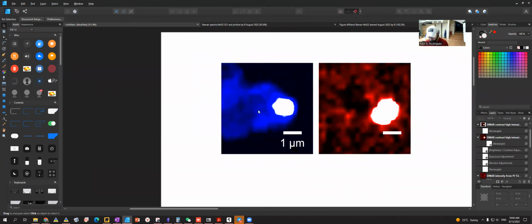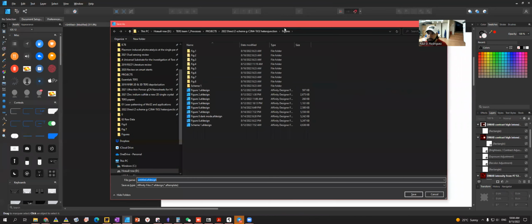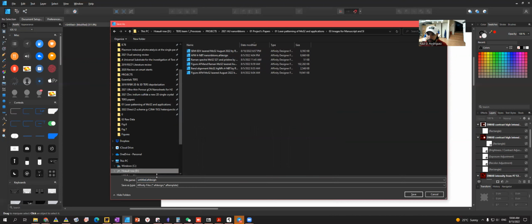Something else that is very important is to save your projects. I need to go to the folder.